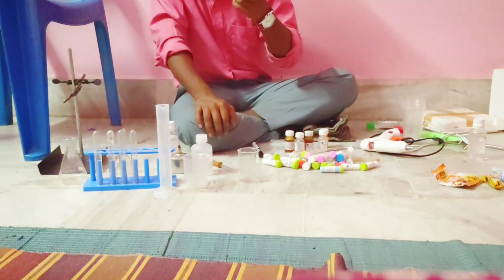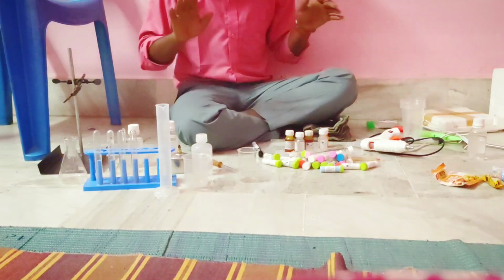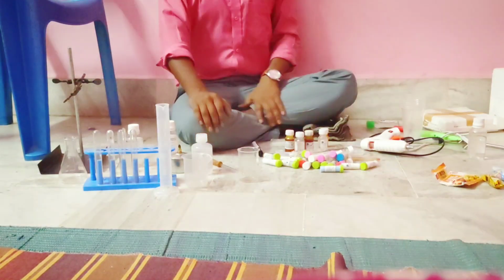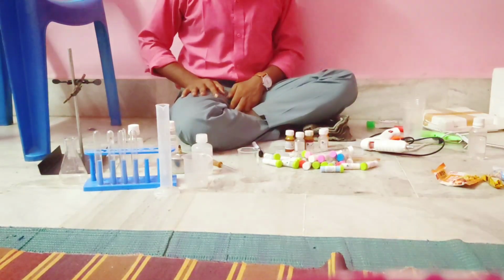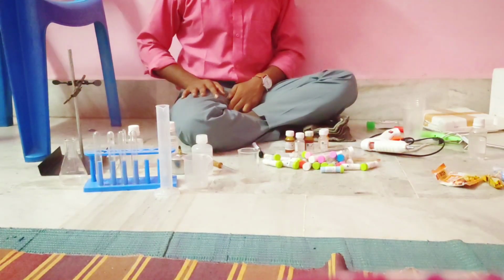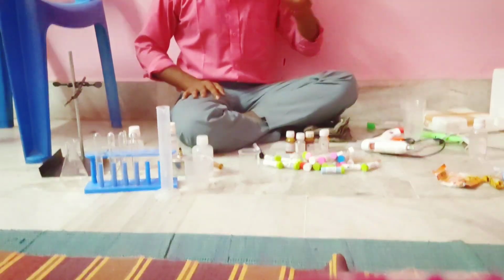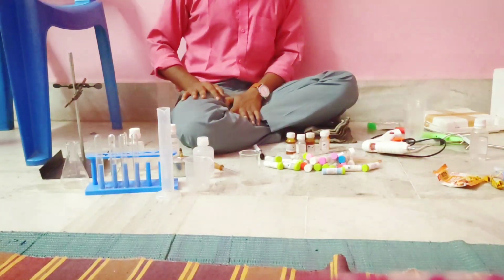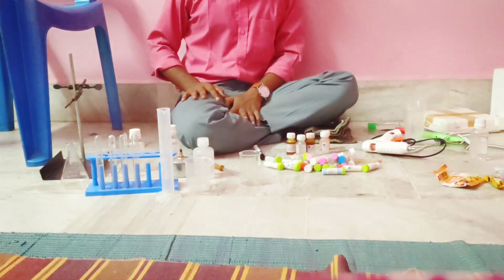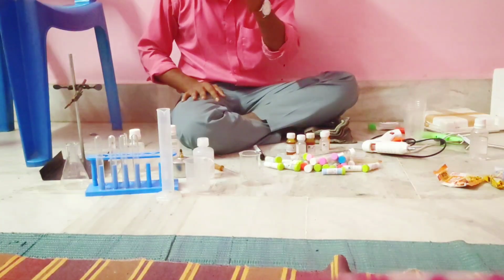We will make dilute sulfuric acid solution. Let's make salt. How will you identify that it has turned into salt? There will be no change visible. That's why we use an indicator. Indicators are very useful substances to identify when the medium of the solution is turning or changing.